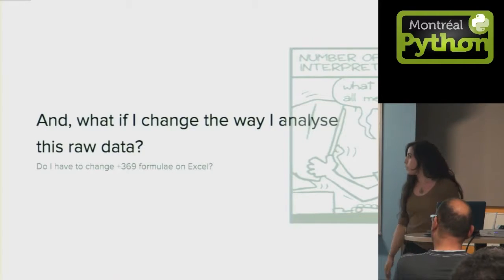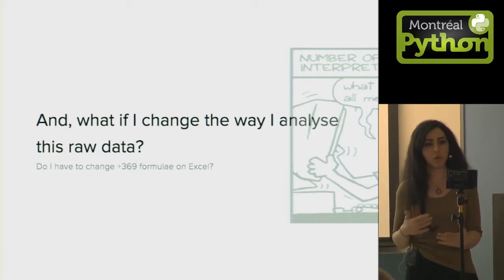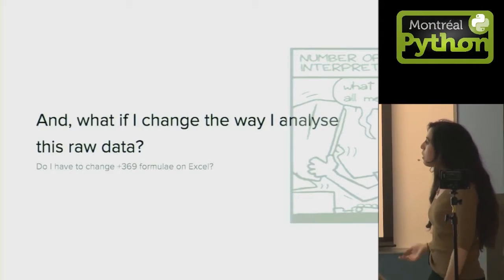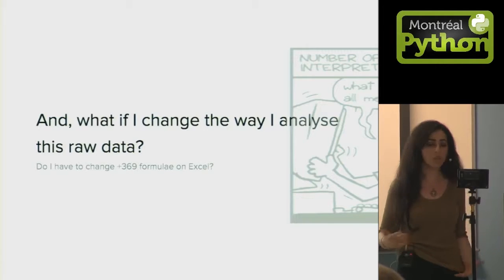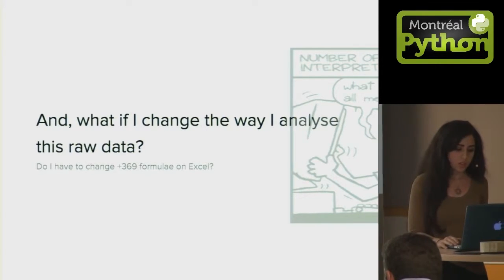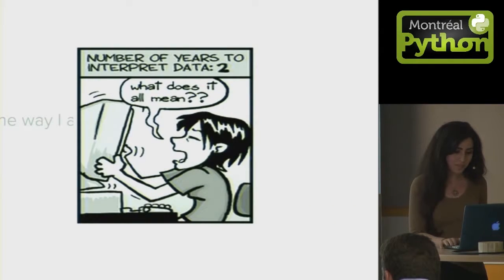So also, what if I change the way I analyze this raw data? Like, what if I change how I normalize the curves, the recovery curves? What if I change how I want to fit the data to a certain function? If I did that on Excel, I'd have to change a bunch of cells, and it will take forever. So this was me at some point.